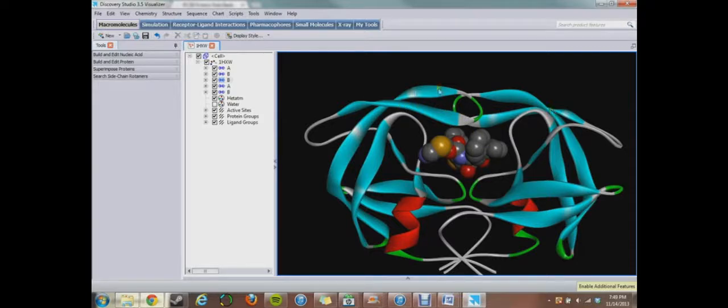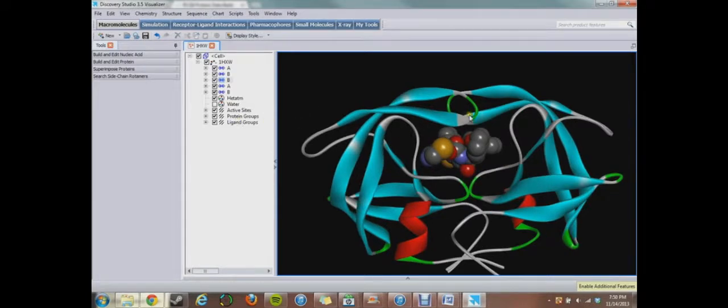I think these two arms fold down and grab this inhibitor as though they're going to cut it, because they're recognizing it as a protein, and then they can't. But we need to identify the important amino acids that are interacting with this. The nice thing about the HIV protease, and I don't know if you guys have this, I'm going to assume that all of these are important in the role because they're under this heading active site proteins.